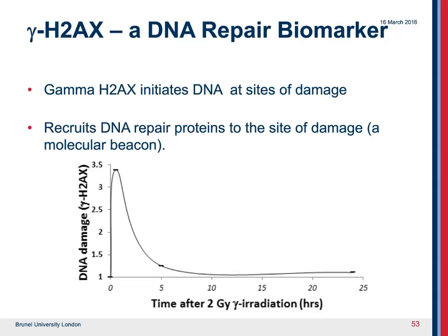So if we look at a kinetic of DNA damage after irradiation, you see within a few minutes at time 0, straight after irradiation, the induction of DNA damage as measured by gamma H2AX. And then within a few hours, the repair of the double-strand breaks occurs and gamma H2AX is dephosphorylated and we lose the appearance of those foci.